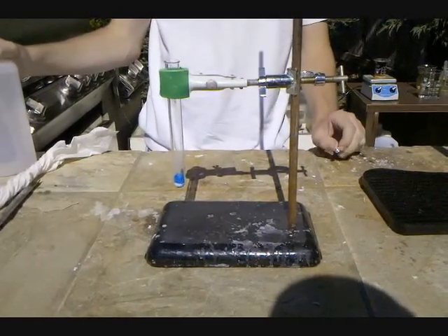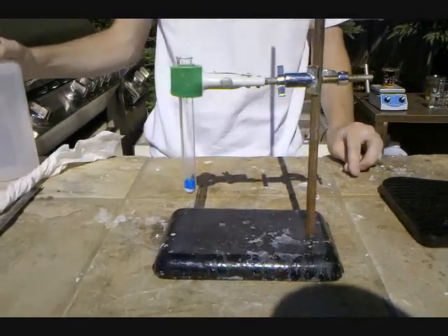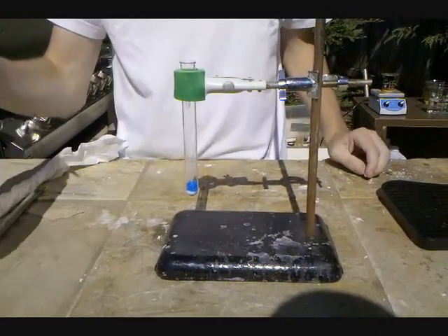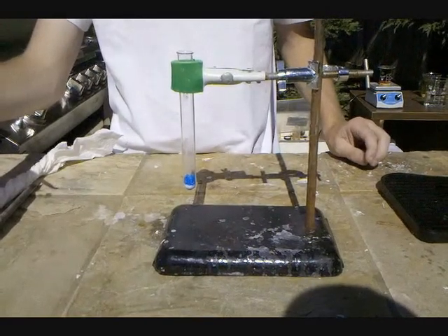Hey everyone, in this video I'm going to be showing a way of dissolving aluminum metal. The method involves a solution of copper sulfate and sodium chloride. This solution is not very well understood by chemists right now, but it's known that two reactions are happening.